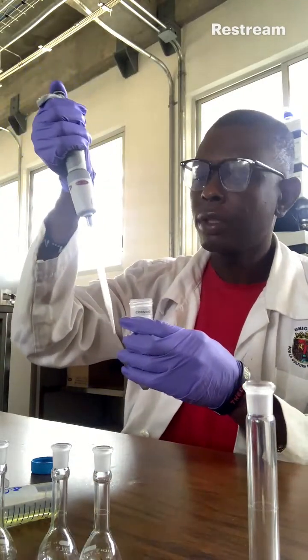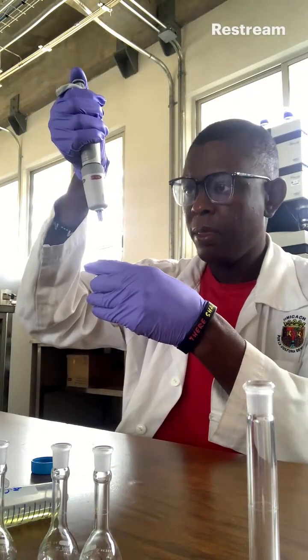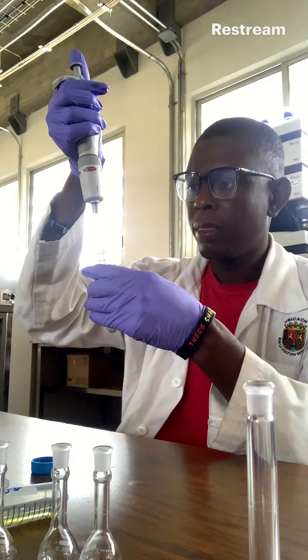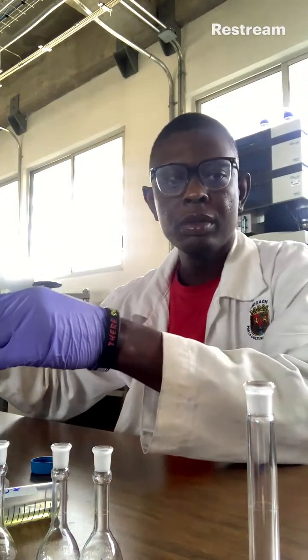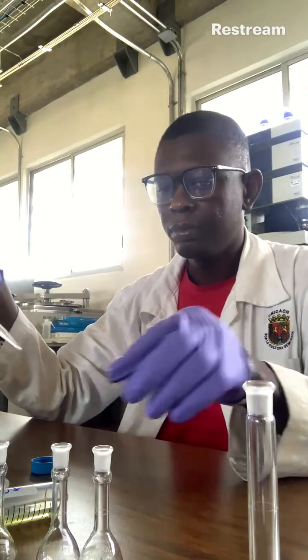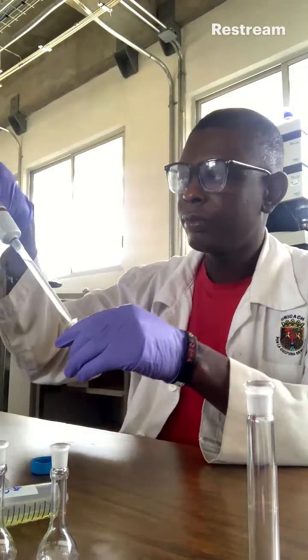I press down and put it into this bottle.